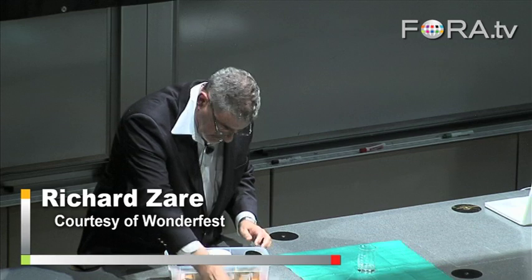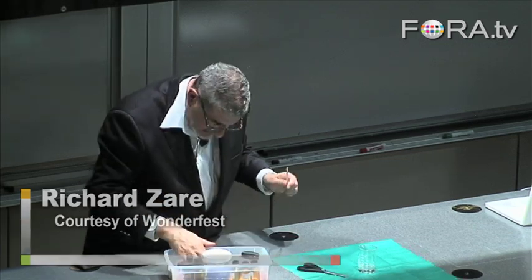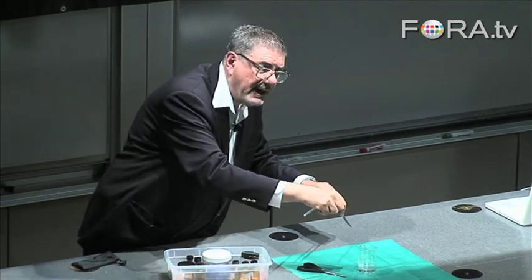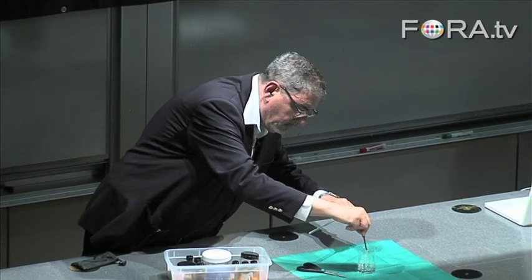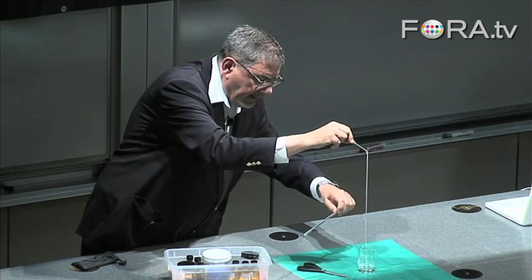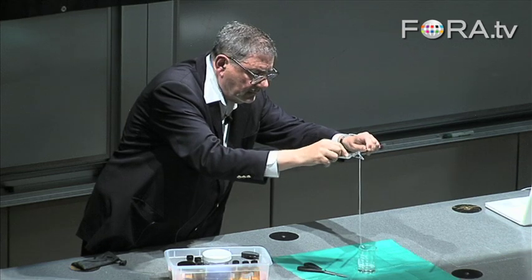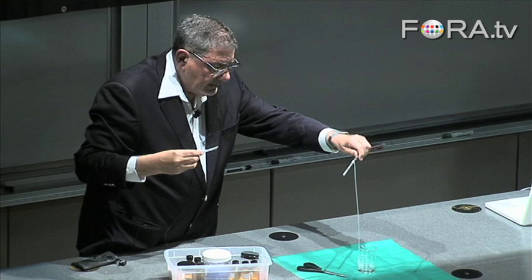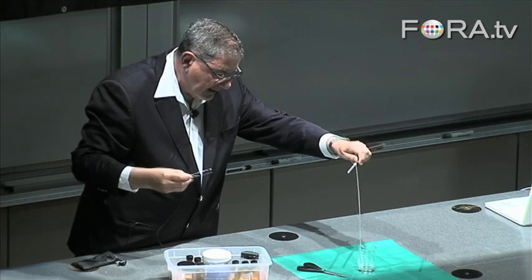Take this out in case you want to clean up a mess. Get some scissors, glass tube, some tweezers. Hopefully you're able to see this. You see what I'm doing? I'm pulling out nylon. This is nylon 6-6. And now I can take this nylon, and this gets tiresome. Lots of chemistry is tiresome.